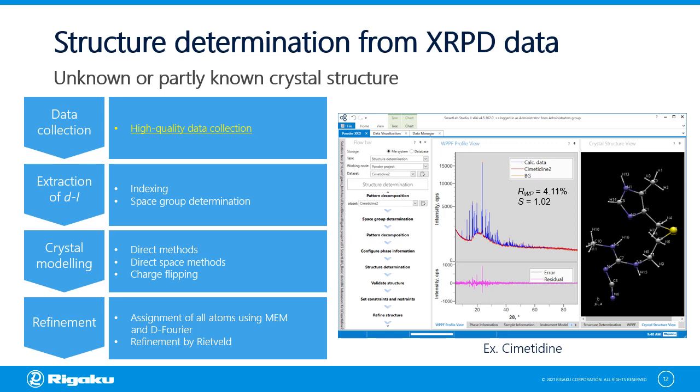By having these two diffraction peaks for all HKL diffraction peaks from your sample, peaks will overlap more. This makes structure determination difficult. The Johansson K-alpha-1 monochromator, which is discussed in the next slides, will monochromate the X-ray energy down to pure K-alpha-1. This decreases the total number of peaks by half and also decreases peak overlaps.